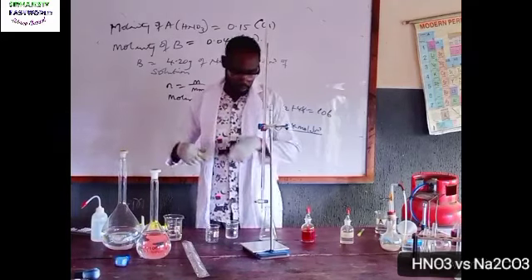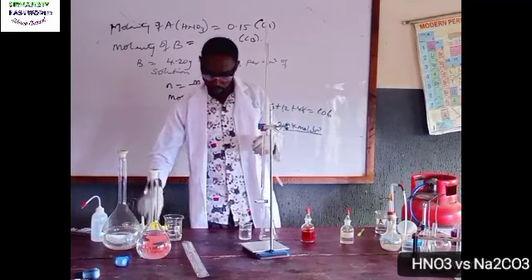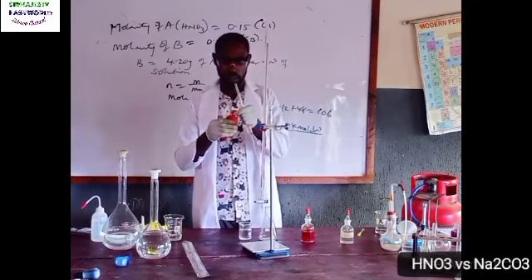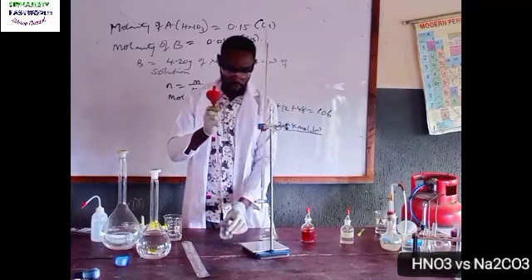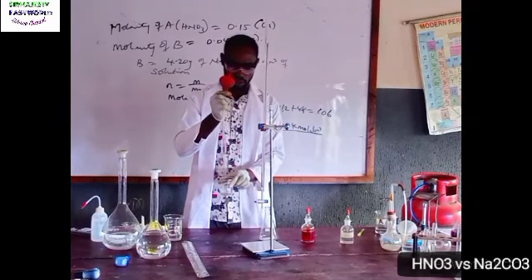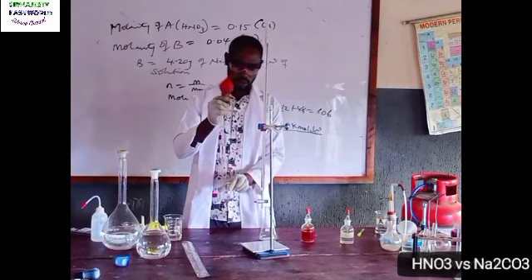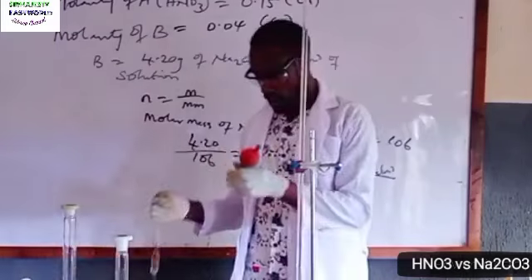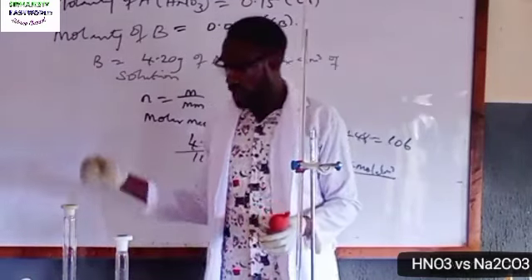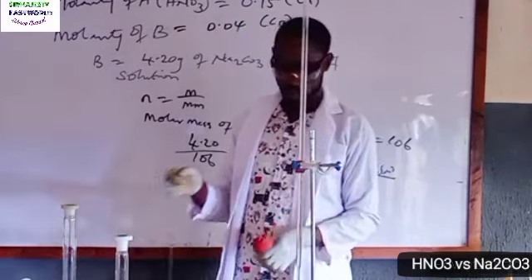This is my pipette. This is the base. This is my pipette filler. It's a very easy thing to use. I'm discarding this just to make sure there are no contaminations.